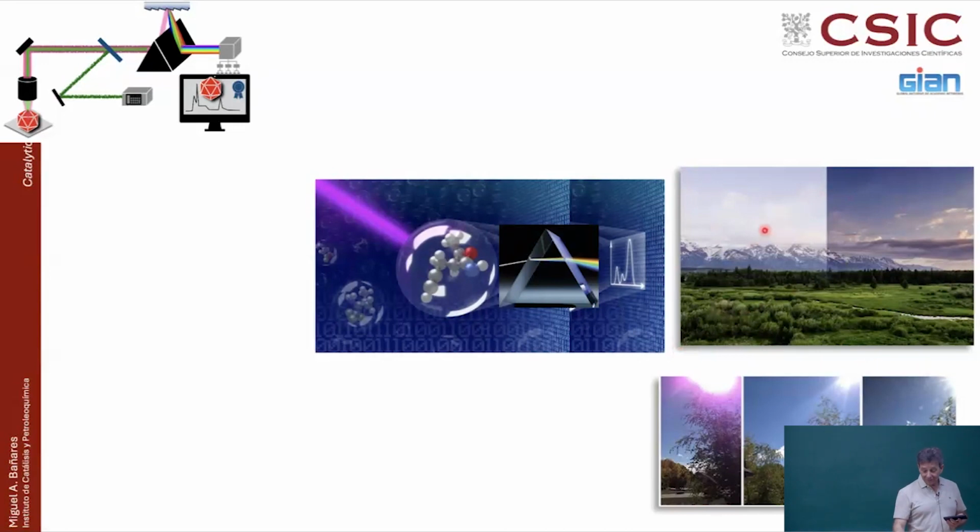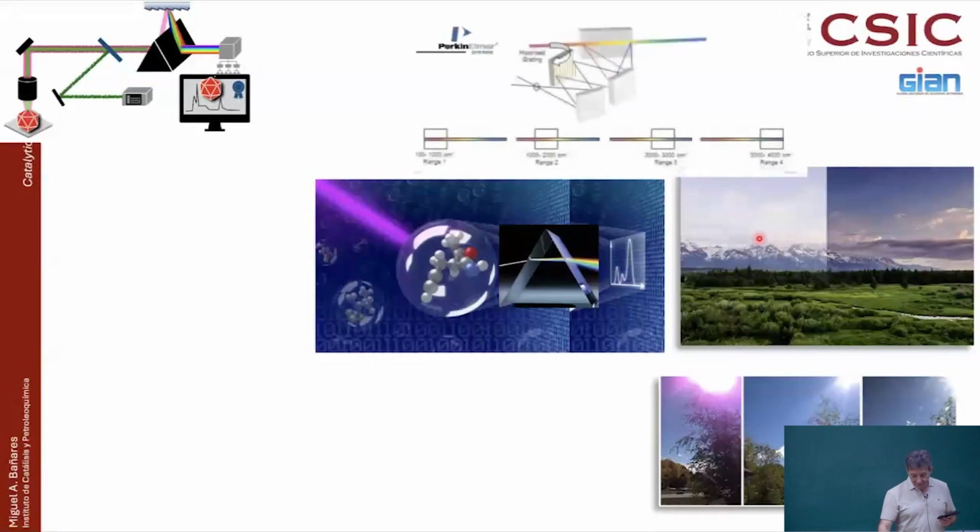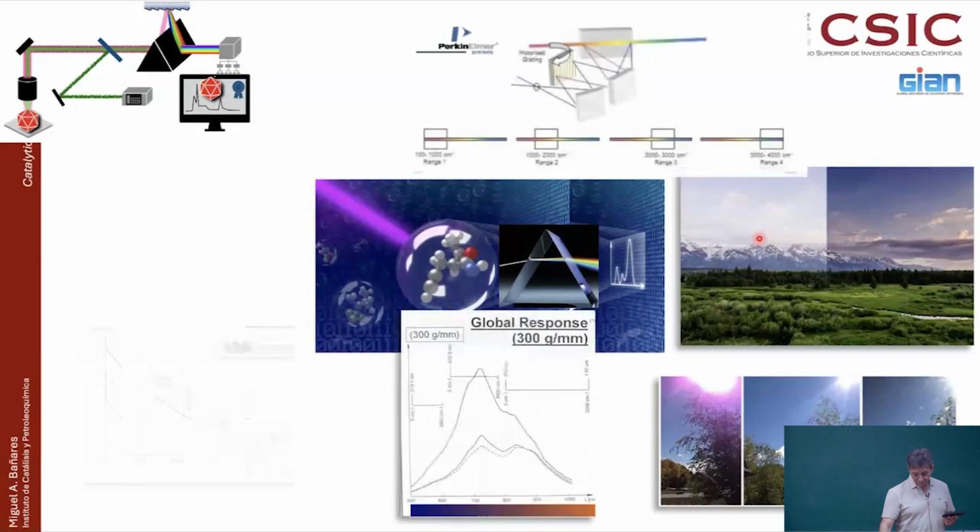With spectroscopy, things like that happen. And of course, this is the landscape. This is the same landscape, the same place, but these little differences in spectroscopy mean different positions, different relative intensities, different peak widths, because of very many things associated with how you illuminate, how you acquire, and how you process the signal. And that is a big headache.